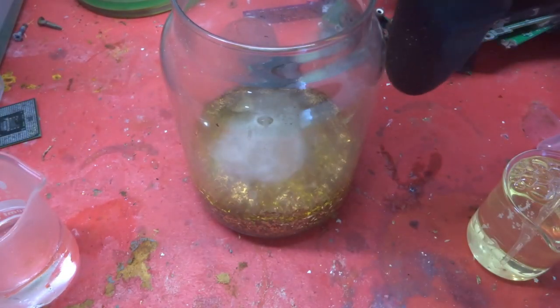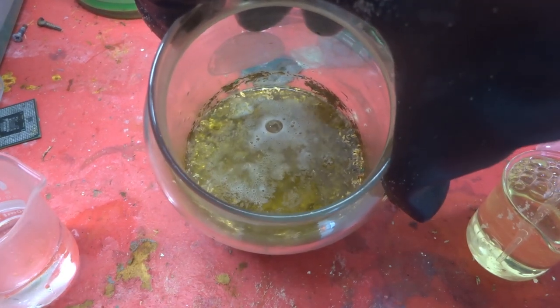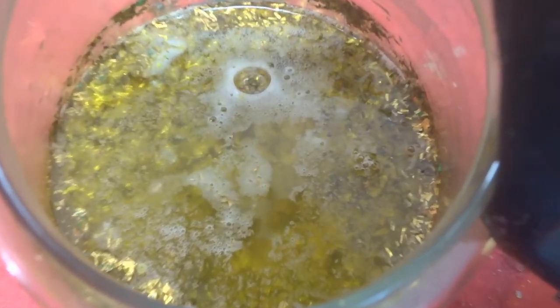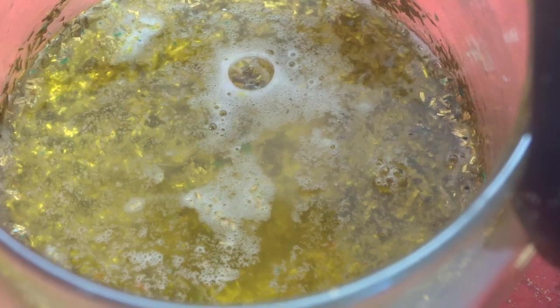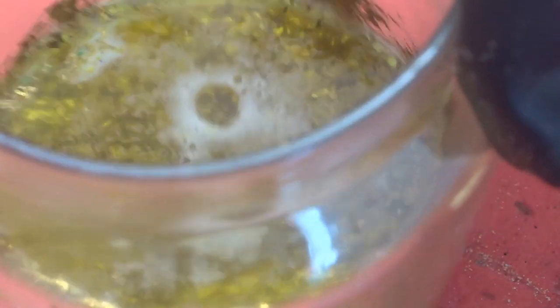We'll have a look at the jar and see what's happening. You can see the reaction taking place between the hydrochloric acid and the bleach, which in the process will dissolve the gold and put it into solution. I may need to add more hydrochloric acid and a bit more bleach, but for the moment I'll let that work away.